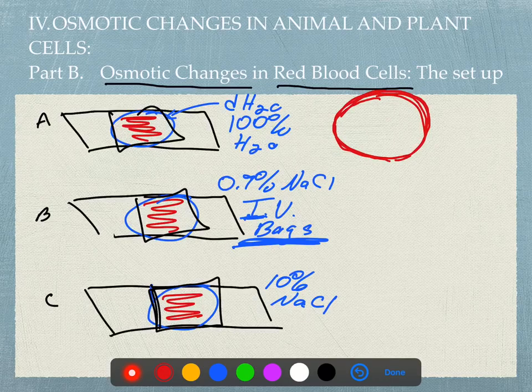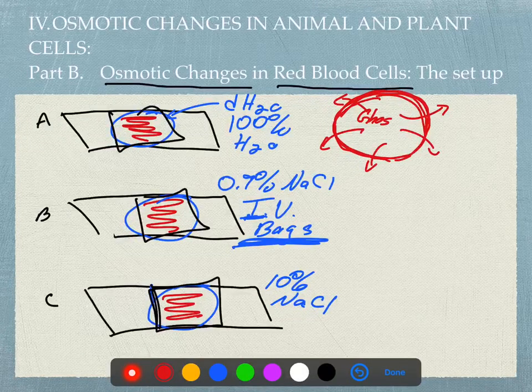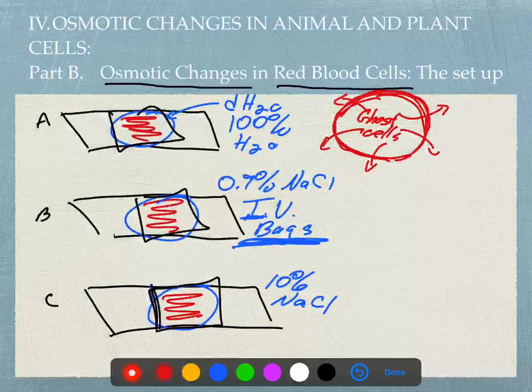And they're kind of difficult to see, in fact, because once they start filling up with water, the hemoglobin that gives them their red color starts leaking out. So they start basically looking like just cell membranes filled with water, and for that reason we call them ghost cells, because they're really hard to see. But I'll show you images of what they would look like with a better microscope.